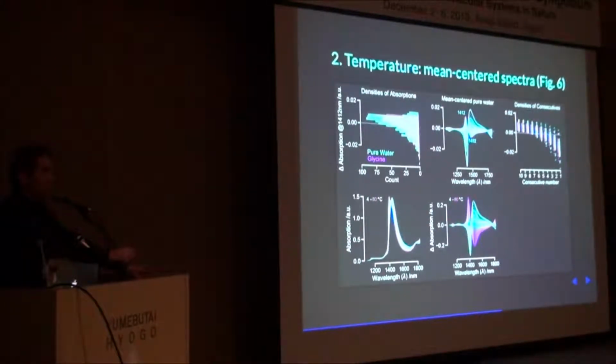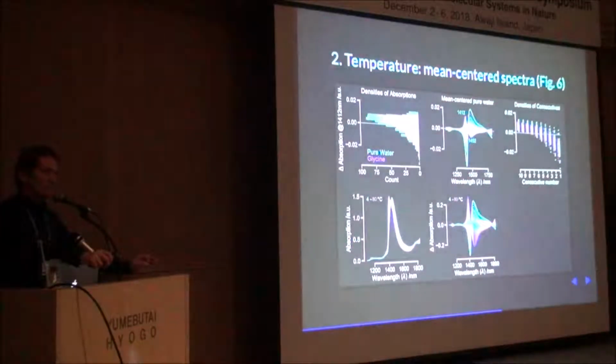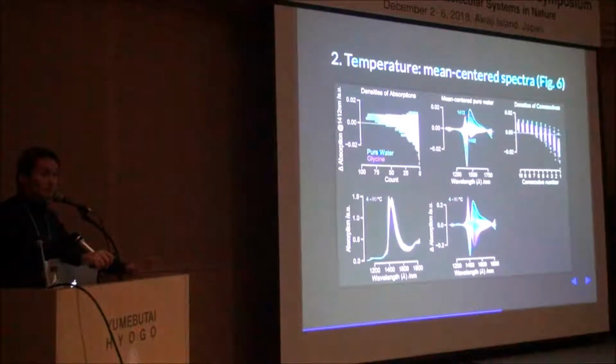And the point is, because this is all at room temperature. Another thing that I omitted is that the compartment that I use can regulate temperature. So I was fixing everything at 32, because that's the lowest temperature I can get without overheating the samples. So this was all done at more or less constant temperature. And the point is that if we have a variation around the mean, we always expect that to be a pure Gaussian. What we see here is a very asymmetric Gaussian, and that's already a red flag. So we have to understand what is really happening here.